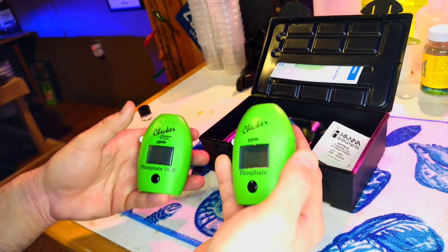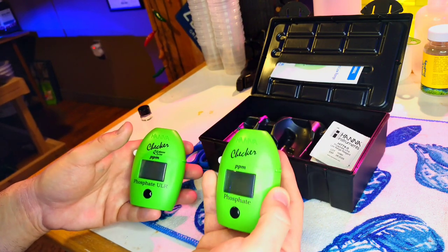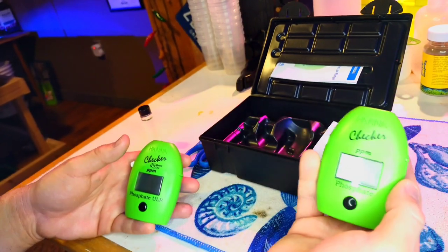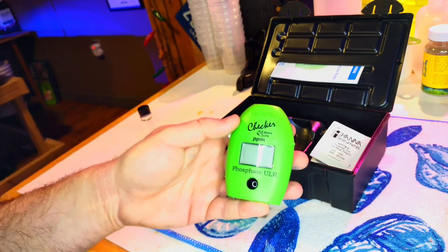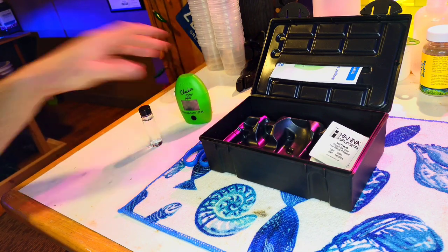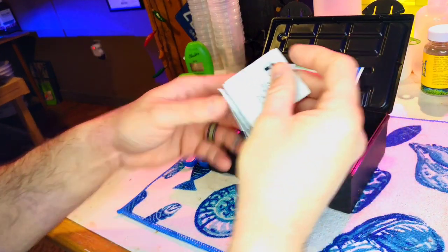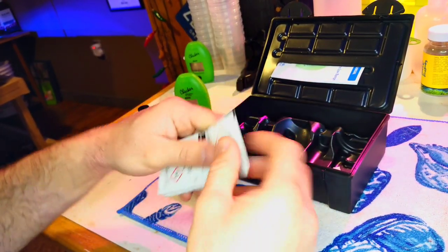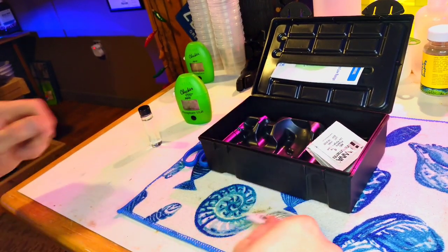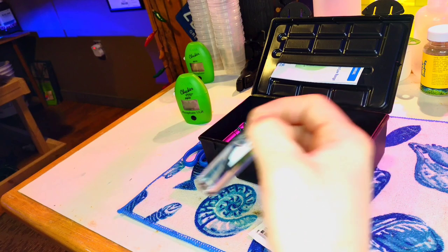If you have the regular low range checker, don't worry — it'll still work okay. Just know that if you run a low phosphate level, you may read zero a lot because it's only good to 0.04 ppm plus or minus. The ultra low range is usually the one people have for SPS tanks. To do this test, it's very similar to the alkalinity test, but instead of a liquid reagent it gives you little granules — it does use one reagent. I've got my vial filled here, and you want to clean all the smudges off your vial.